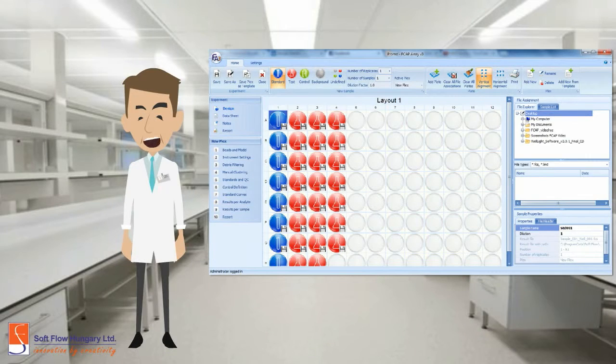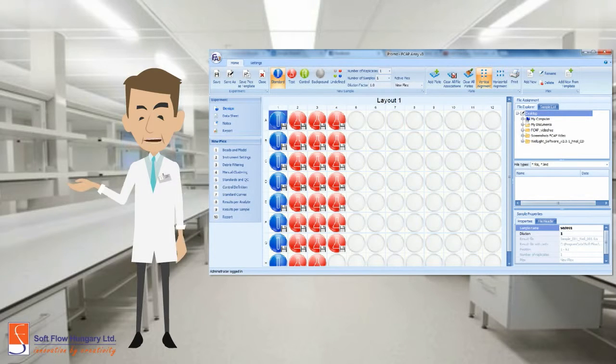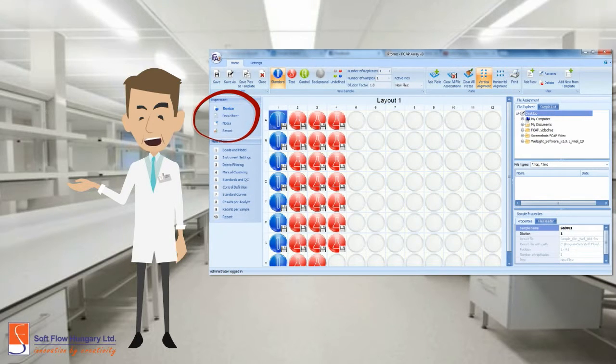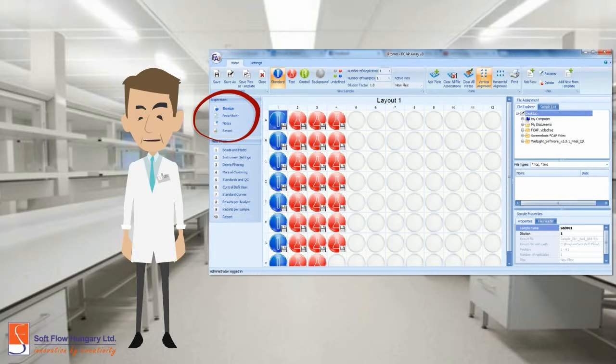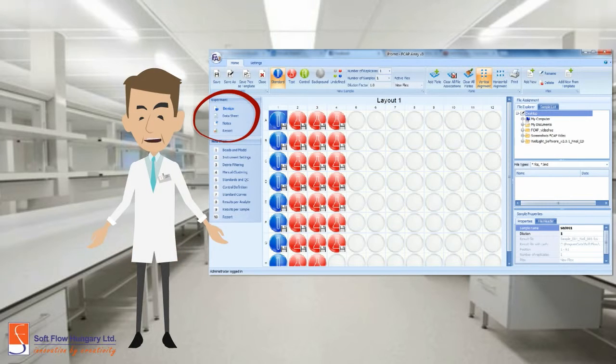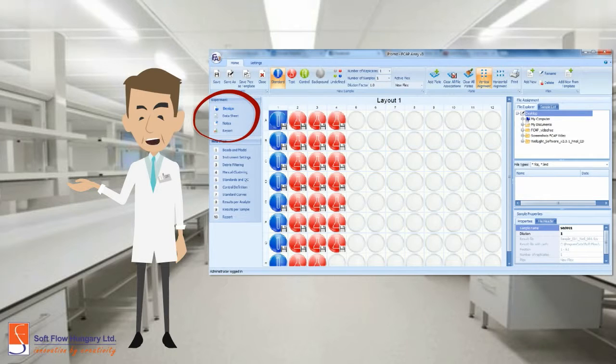Now, you are in the experiment area. Please check the experiment menu in the left side of the screen. There are four functions you can use: Design, data sheet, notes, and report.